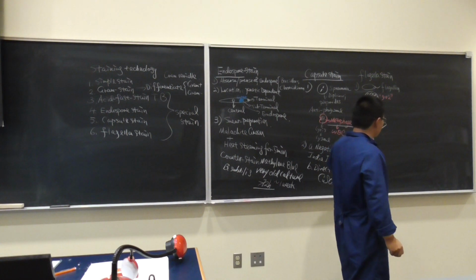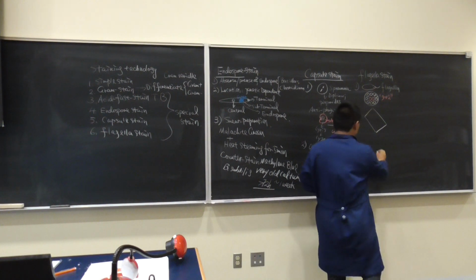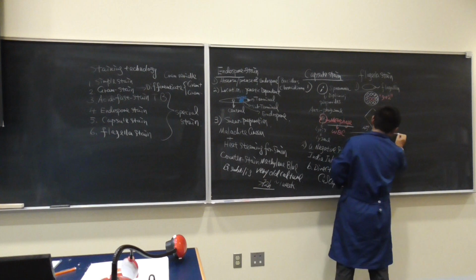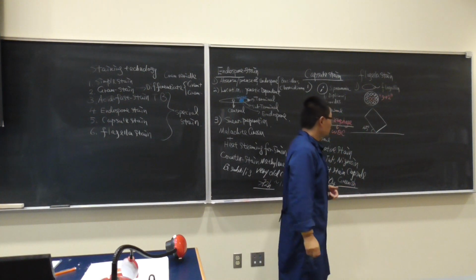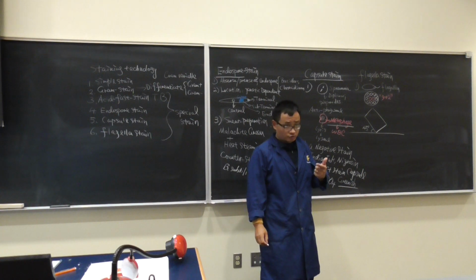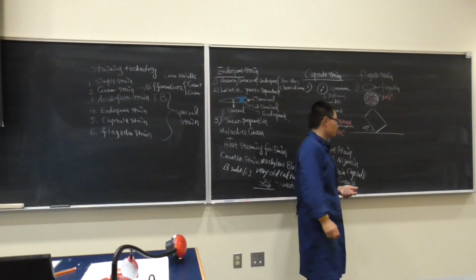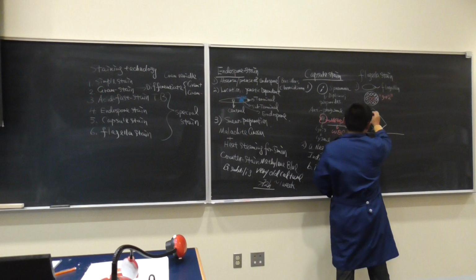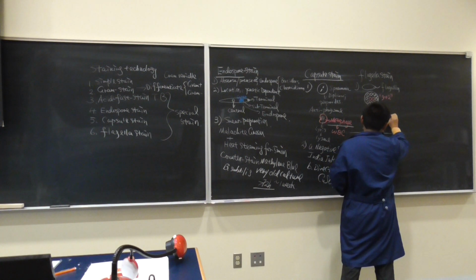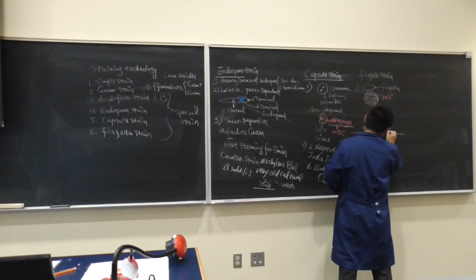One is at about a 45-degree angle, and the other one just lies on the bench, very similar to what you did for the blood cell calculation. You need to let it roll. The flagella is very thin and very soft, so let it roll down.